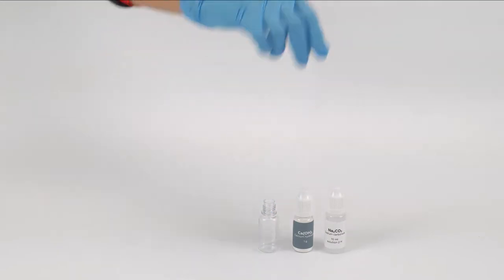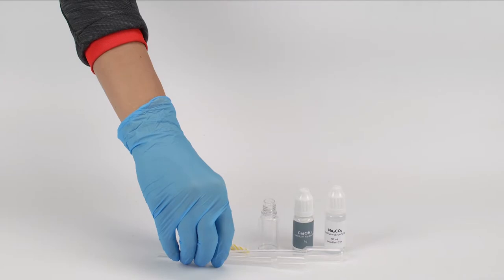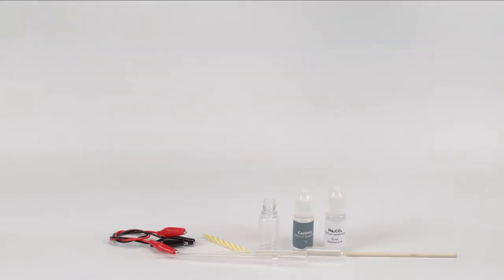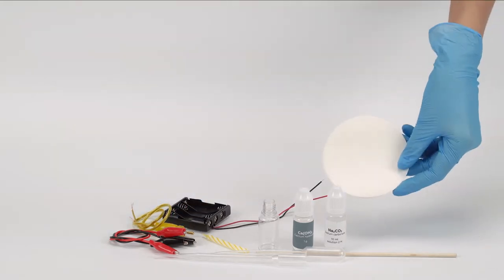Take an empty reagent bottle, a candle, a pipette, a filter body, a wooden stick, two wires with crocodile clips, a cable plug, the battery holder, and a filter paper from the experiment set.